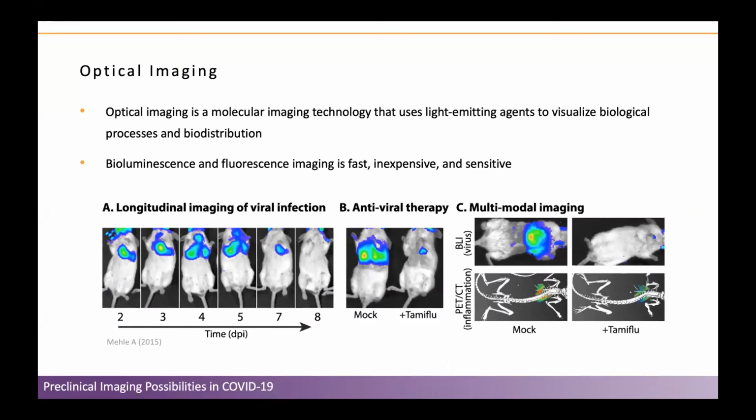And the last technique we're going to quickly talk about here, and something you might be able to integrate into your work, is optical imaging. So we're looking at bioluminescence and fluorescence imaging. This is a really, really nice opportunity to track biodistribution and processes in vivo here. So in optical imaging, you have some cell or some tagged particle, and you allow it to distribute and move throughout the body through various processes. And then basically you are able to track where it goes based on the amount of photons it gives off, and you're able to count those.